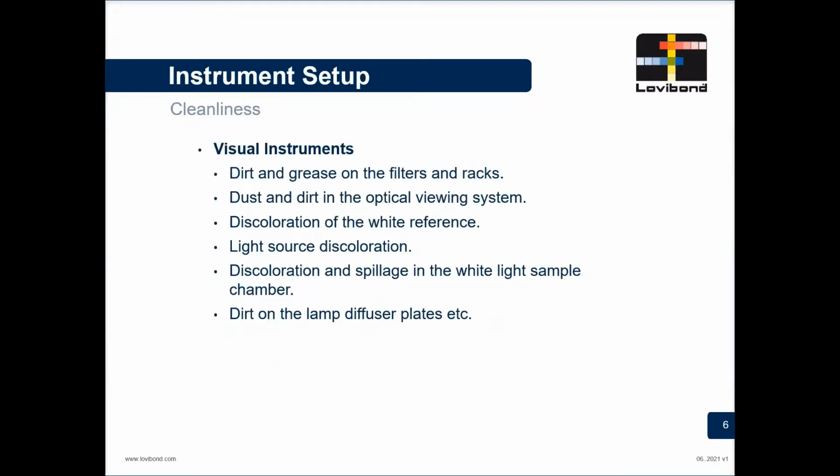One major thing that we need to check with our instrument is our cleanliness. So if we have our visual instrument, we've got sliding glass filter racks, but these are open on the top, so it's very easy for oil and dirt to get down onto the glass rack. So we should be cleaning them, because when we slide them in to make our colour match, we're not making a colour match with just the glass.